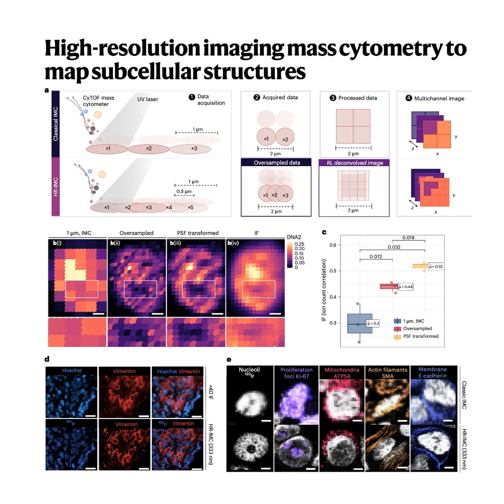Regardless of those limitations, though, HR-IMC fundamentally moves the field. We have moved from mapping large cell populations to mapping the internal landscape of the cell in relation to its hostile environment. This ability to see localized drug effects and metabolic changes, like hypoxia, at the level of the organelle context, could radically reshape how we identify biomarkers and understand the complex mechanisms of drug resistance. It provides the spatial resolution we need to analyze the intracellular processes that underpin fundamental biology and therapeutic response. It just makes every subsequent experiment higher fidelity.